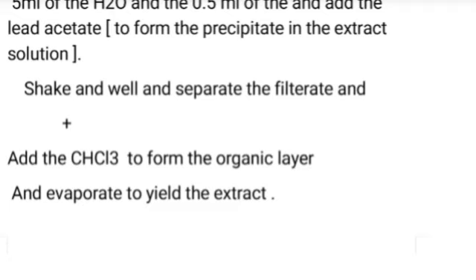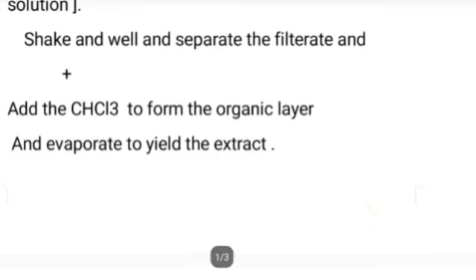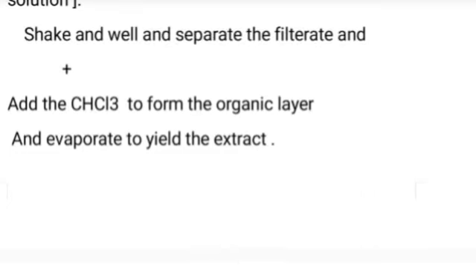To that, add the chloroform to form the organic layer. Why? Because we need the organic layer, and we evaporate it to yield the extract. The solution which may be dilute we are making concentrated, meaning a thick solution, so we evaporate the excess water.